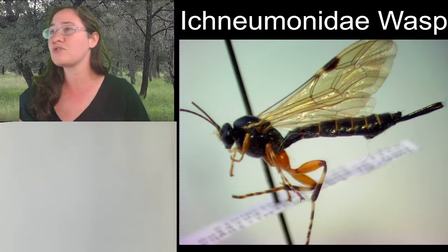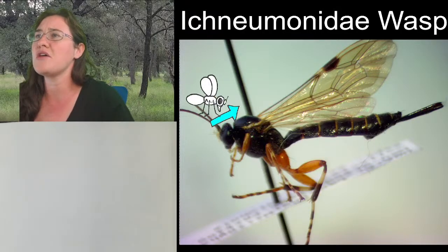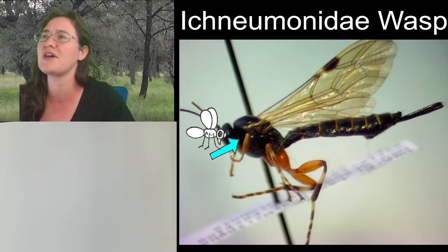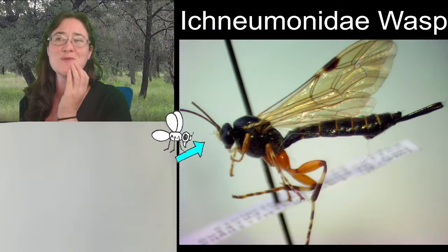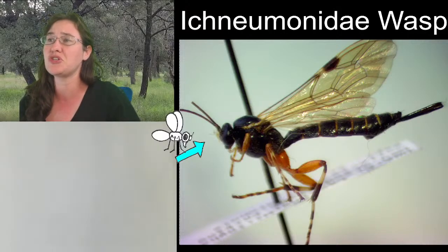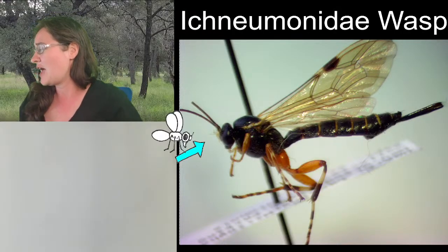We are looking at this absolutely gorgeous ichneumonid, and you may notice that the pin looks like it's a lot further away than the wasp if you're looking at the degrees of focus, and you would totally be right. This wasp is not pinned through its body. This ichneumonid wasp is actually pointed. So if I turn it around to the other side, you could see that there's a small piece of paper glued to the right side of the thorax, and that piece of paper is pinned through. That's because this guy would have been more difficult to get a pin through without damaging any of the characteristics. And so it's just pointed.